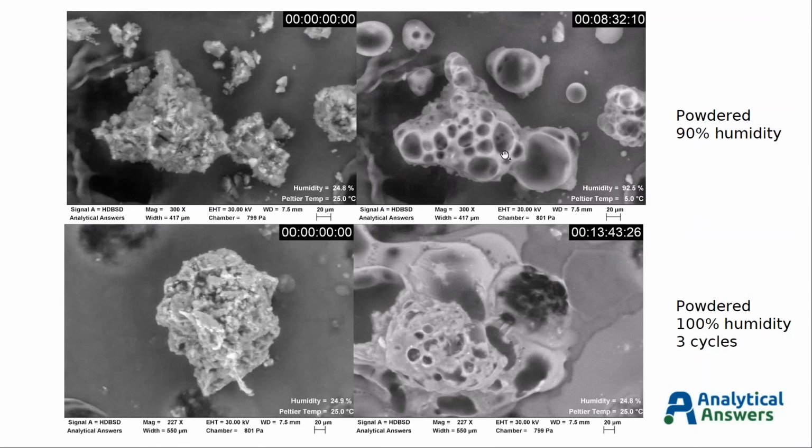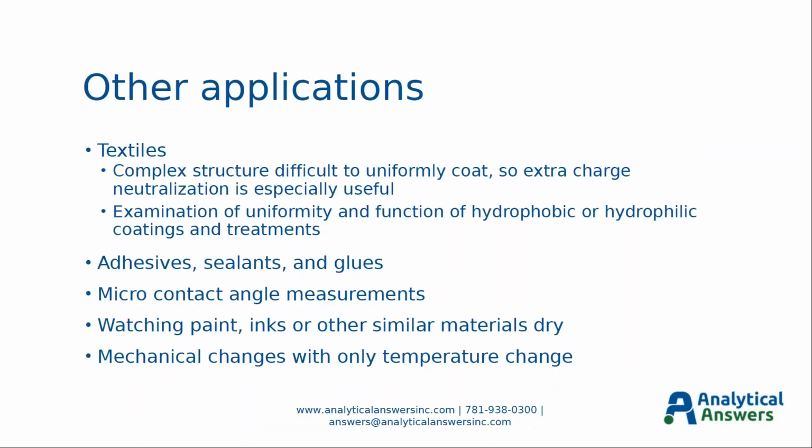And again, we have before and after stills for each of these samples so that we can do more detailed comparisons and spot checks during post-review, as opposed to having to watch the videos multiple times. We can take these screenshots to get a better look at each of those stages in its decomposition. That's my last fully worked through example. I do have just one quick video to show you, and it refers to this first example here.